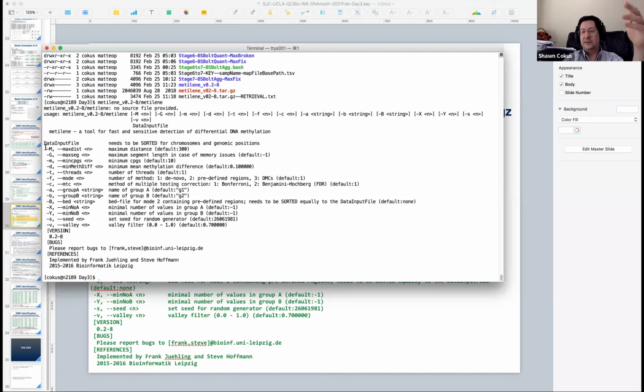Statistical significance is a combination of how much data and how big the effect is, whereas as biology goes, we're going to want to know the size of the effect, because we also like big effects, right? Well, that would be about it, I guess. That's the key information, and that indeed is basically what comes out of this thing, in plain text, tab separated text. That's the information that's going to be there.